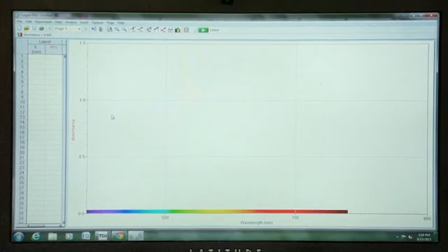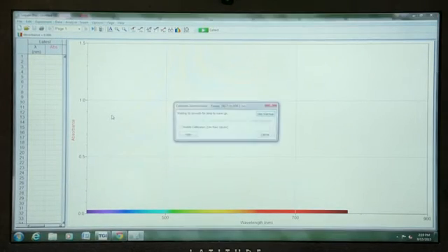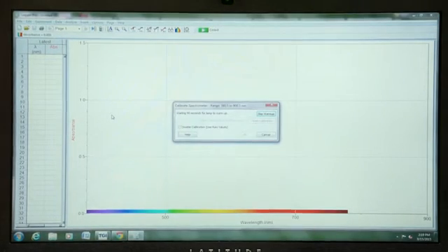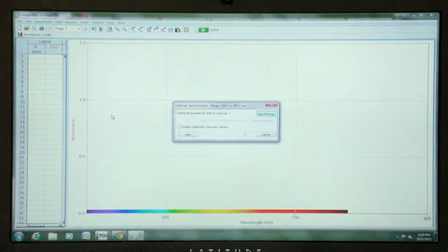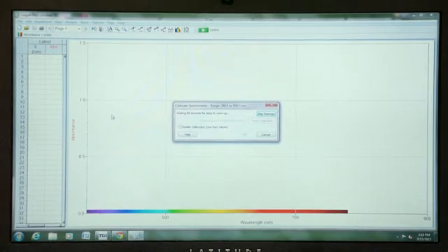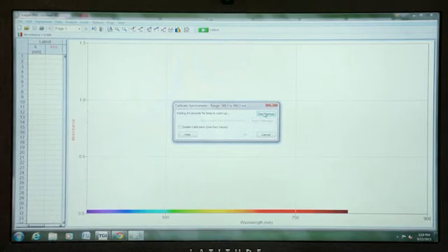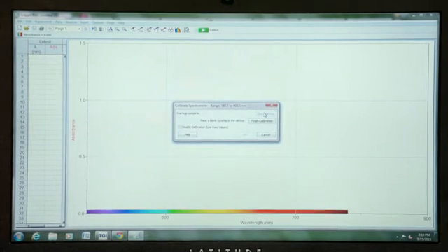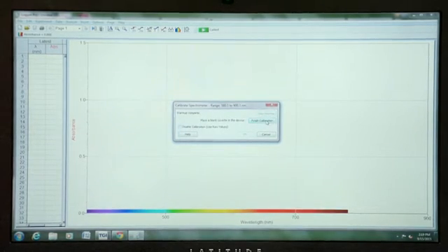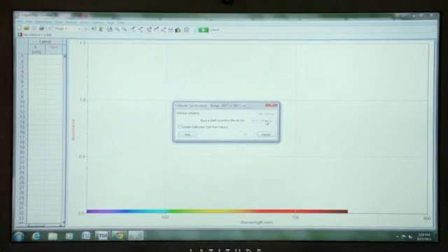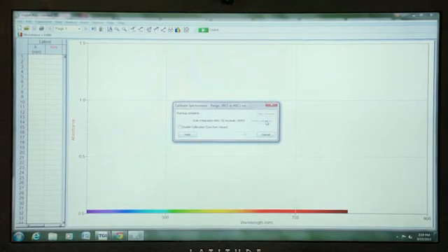The calibration process takes about a minute and a half, including warm-up. For sake of time, and because our SpectraVis Plus has been warmed up, we will skip the warm-up and then click on Finish Calibration to complete the process.